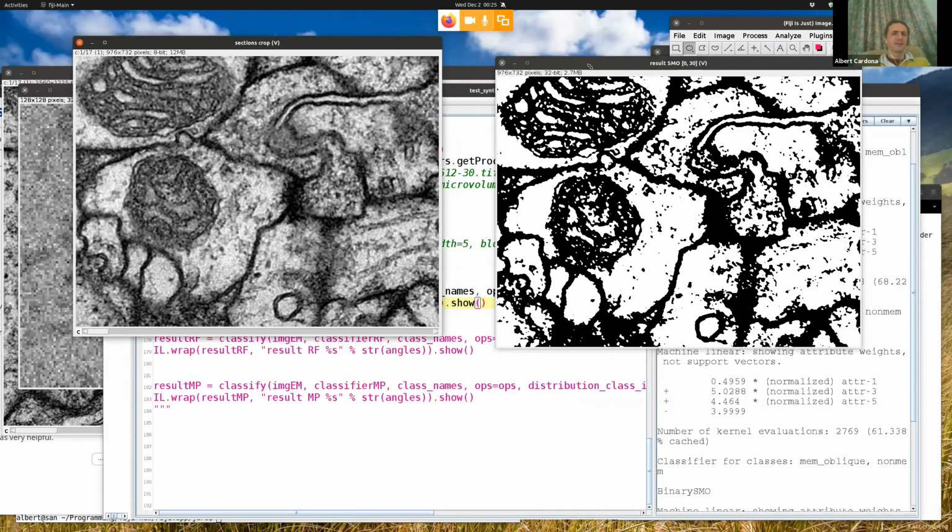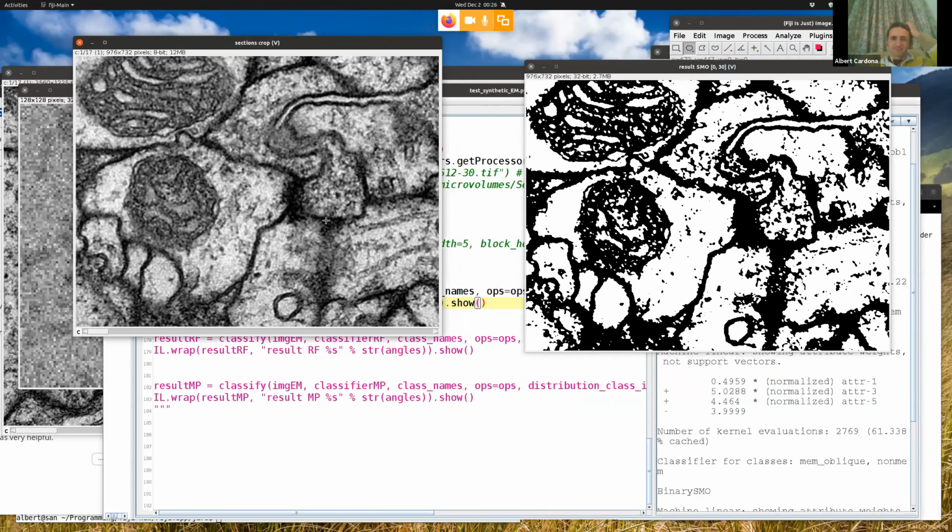And that's it, really. I think we can conclude here most of the tutorial regarding how to deal with very large data sets, how to navigate these large data sets in an abstracted way that enables random access into it. Because most people don't know about it.